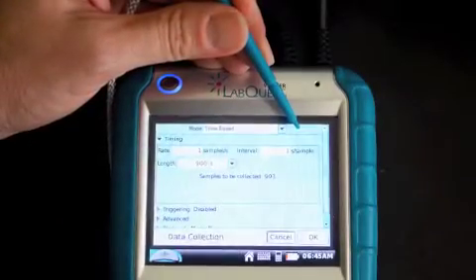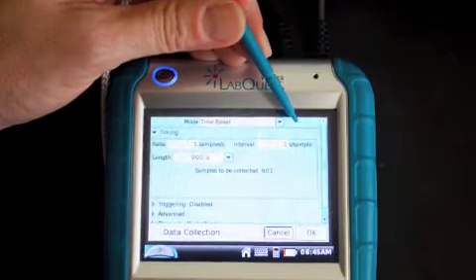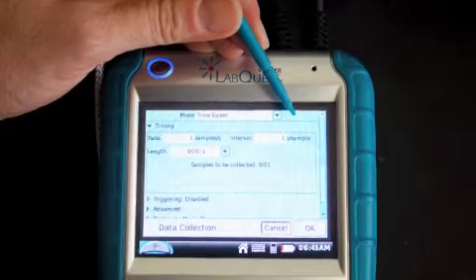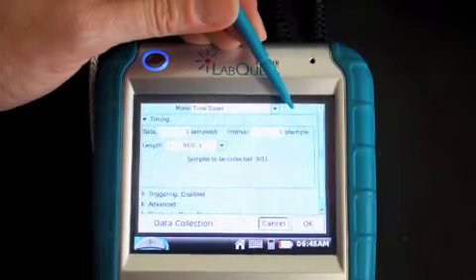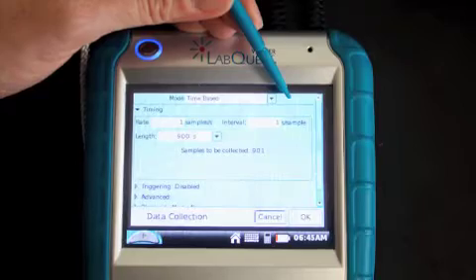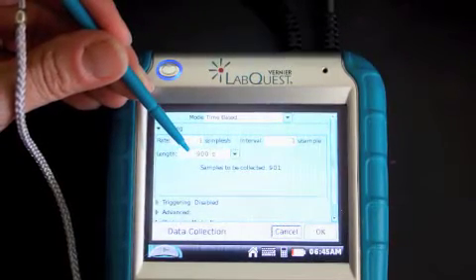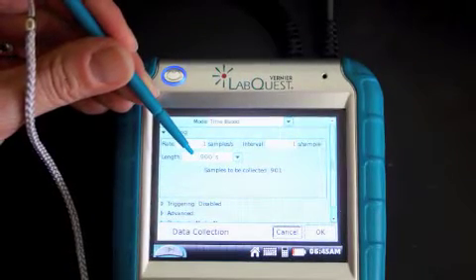This brings up a time-based screen where we can set the length of time and the number of samples that we want to collect. The LabQuest is automatically set up to collect data for 900 seconds, which is 15 minutes, which is a bit too long for us. So instead, we're going to click the Length button and change the length of time from 900 seconds to 300 seconds, which will be 5 minutes. It should be just about right.